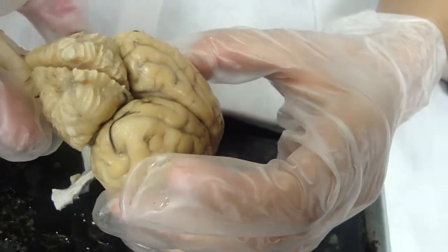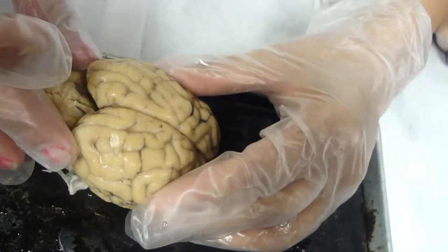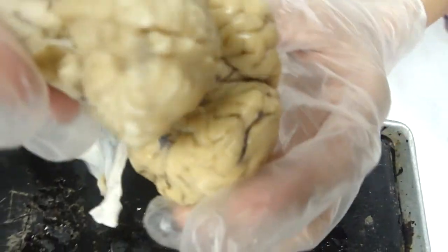Actually, I think what I'll do is take this other one that is still intact, fold it open, and let you see the whole corpora quadrigemina. Here's the cerebrum, here's the cerebellum. Bend it open. Two superior colliculi, two inferior colliculi, making up the corpora quadrigemina: two superior colliculi, two inferior colliculi.